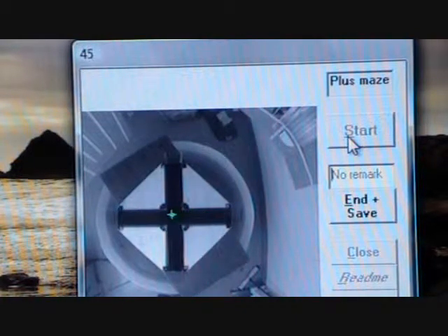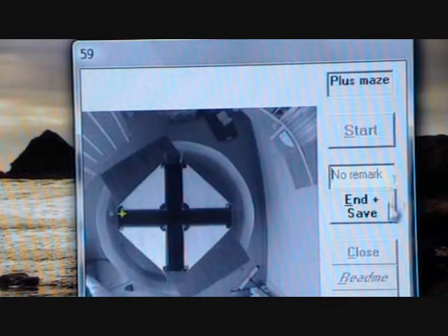So moving, bouncing around. So you can see the green is really tracking the rat movement. And it's also helpful because we don't have any direct light shining right down. We have the diffuse light shining up in the corner. So what I'm going to do before this gets out of hand, so that's 1 minute.